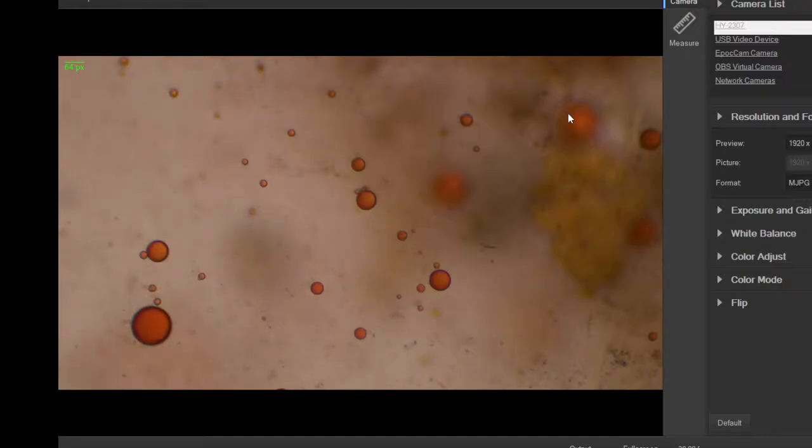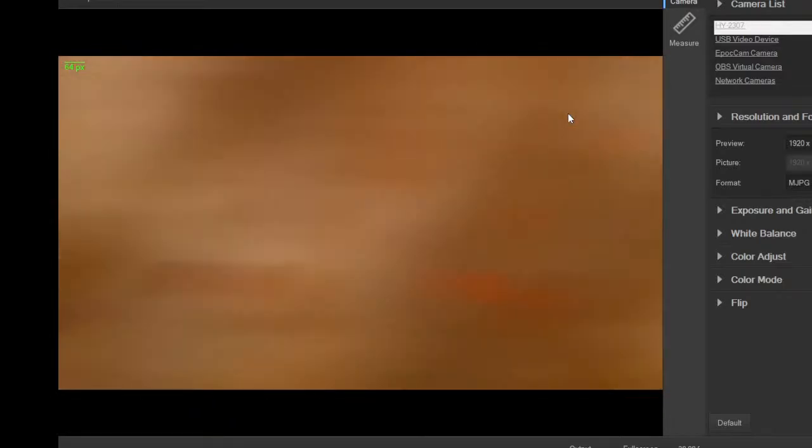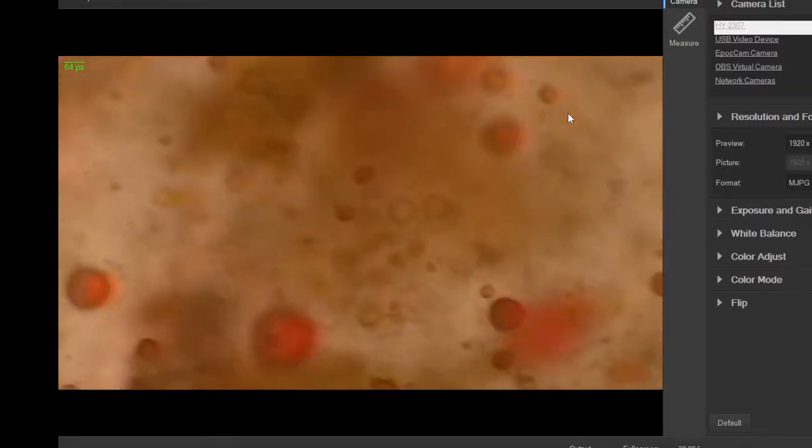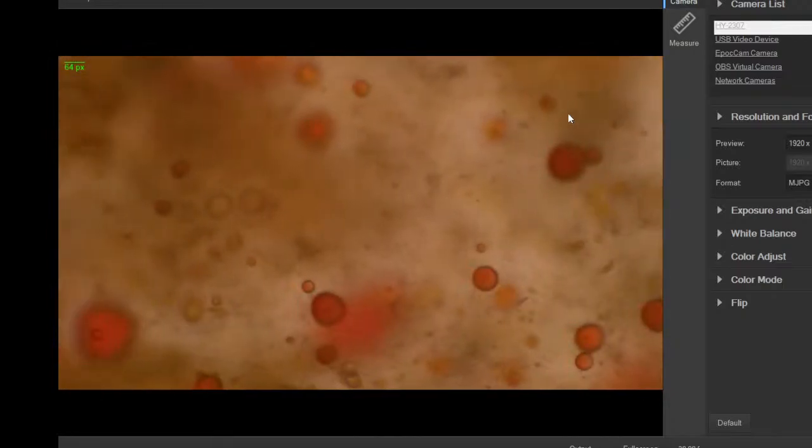Black hole music generator is perfect for this. Very ethereal and creepy, almost. Space music. There's some big clusters of oil droplets in some of these areas. Look at that. It's nuts.